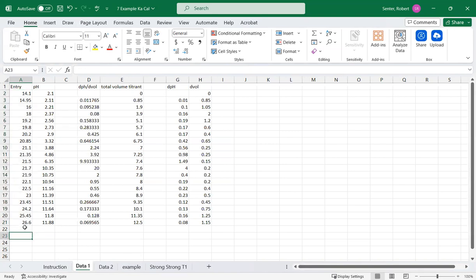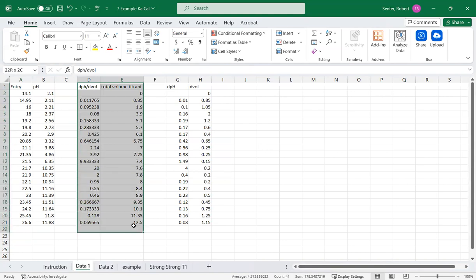So this equals that minus that. So one thing, we can see the similarities, all right? It's so easy to just do a calculation and think it's right. You always want to check and make sure. And then once you're sure about it, now you have the pieces. So now that we have this, we can come and graph this.